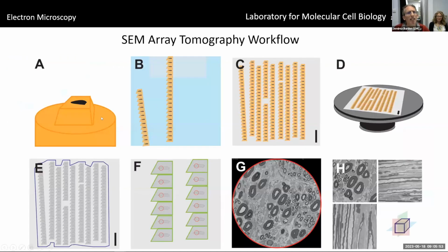Now, the workflow begins here with your block, shrinking it down into a block face that's going to be suitable for sectioning.